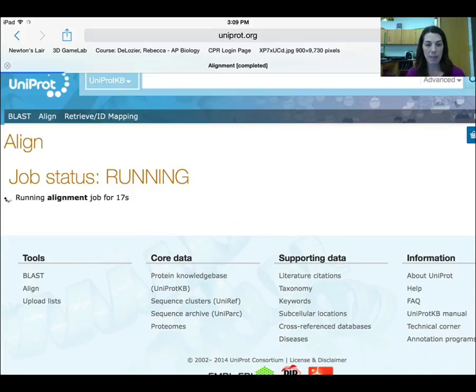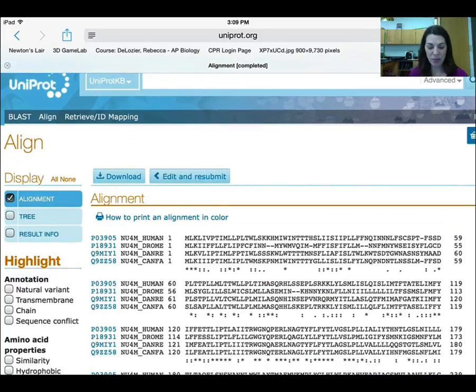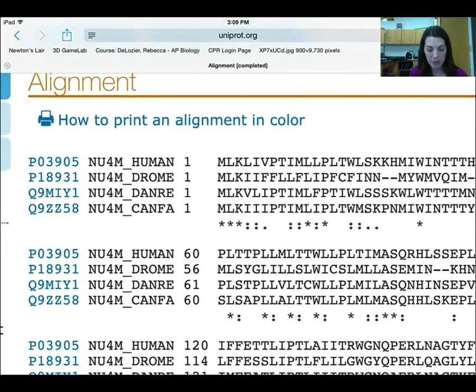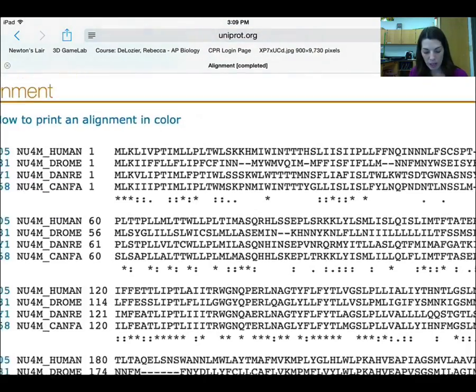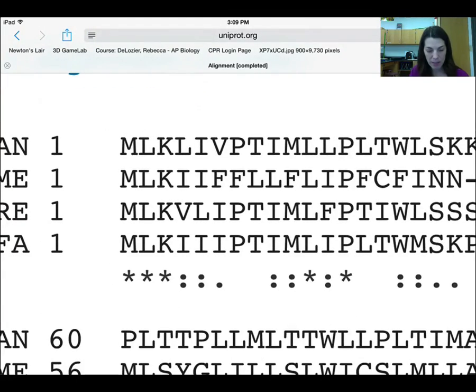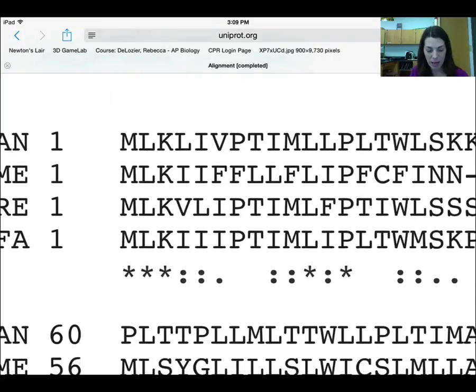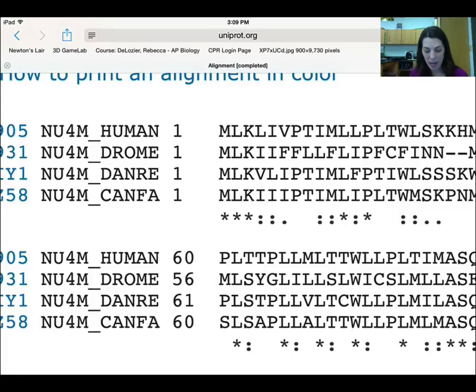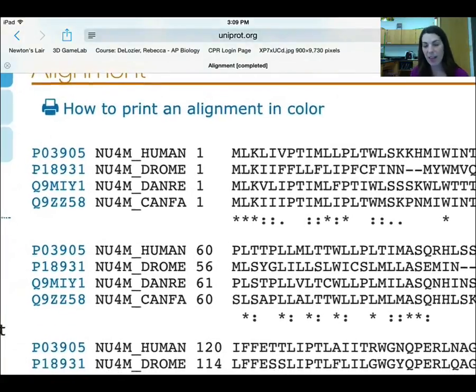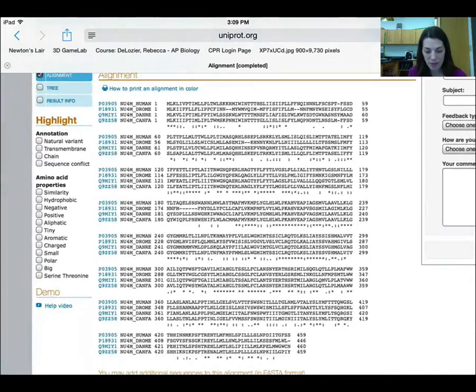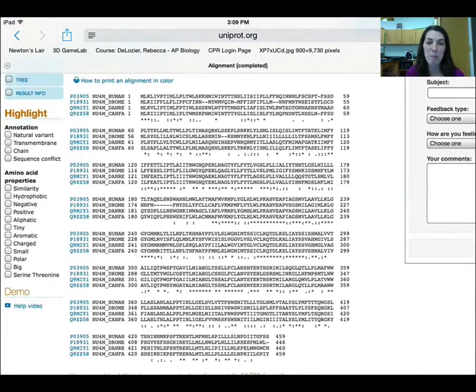This takes a while, but that one was actually pretty short — yours is probably going to take longer. You'll see here we've got an alignment: human, Drosophila (that's fruit fly), zebrafish, and dog. Any time the letters are exactly the same — like M-M-M-M down the front — those are identical. L-I-V-I shows differences. If there are stars, they're exactly the same. The colon means something different from the period, and that information is in your lab. Basically it gives you an alignment for the whole sequence, and your sequence is much shorter than this.